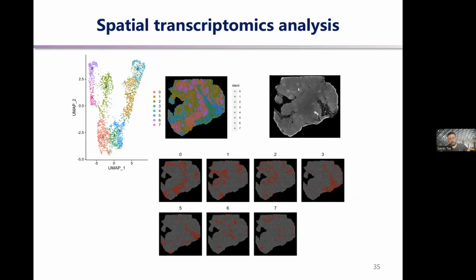Proximity sequencing can be performed using slides that have different capture regions on them. In this experiment we use the commercial Visium system from 10x Genomics, which has these spots. Each spot captures both protein, through our proximity ligation readout, and mRNA. Each dot gives you a tremendous amount of information.